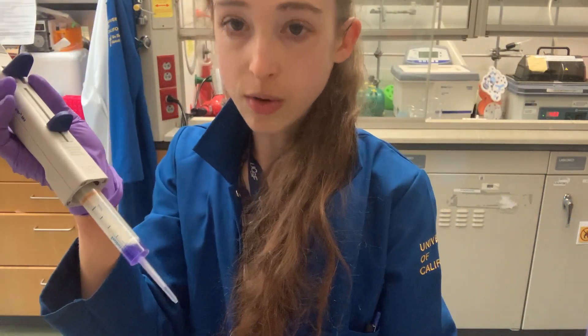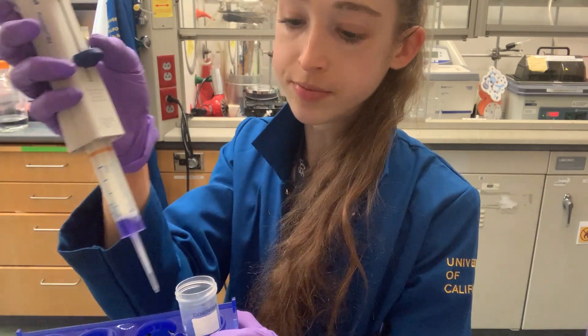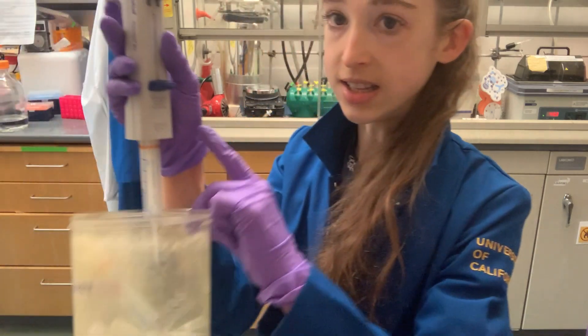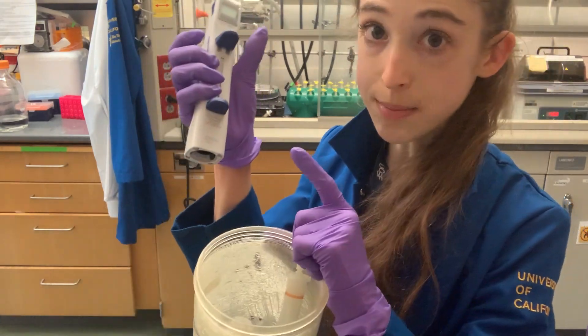When there's some liquid left over, just push it down with the bottom lever to push it out. Then go ahead and eject the tip by pushing down and snapping it out. And that's the basic operation of a repeater pipette.